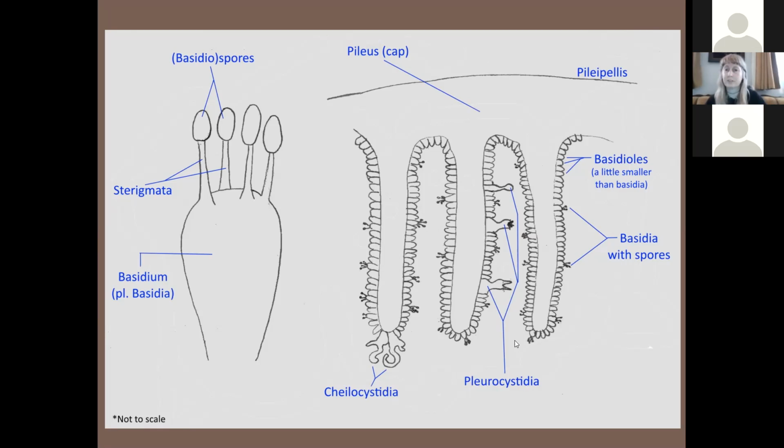So these are features to look for. If you're looking at the stipe of the mushroom, you might also see Caulocystidia. So there's just a bunch of weird cells that nobody really knows what they do, but they look different in different species, so they can be helpful as diagnostic tools for ID. If you get a little more advanced, there's also the orientation of cells that are in the flesh of this area can help you with ID as well.